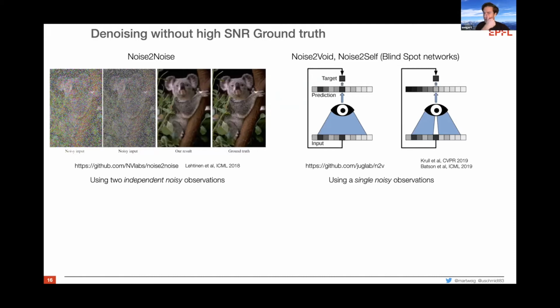And it's not necessarily that you have to do fixed ones. You don't have to do fixed versus live, but of course you can do the same in live cell imaging, and I will show you an example afterwards. You can do some time steps at the beginning where you don't care about phototoxicity. You just sacrifice some of those, or you don't do long time lapse imaging, but just a short time lapse where you interleave those conditions in quick succession, right? So you can use the same live cell reporter or the same fluorophore as you would use during the actual imaging. And this should work way better than just adding noise.